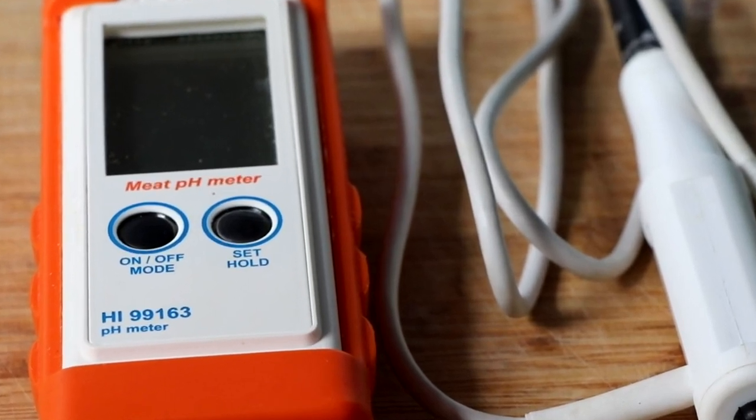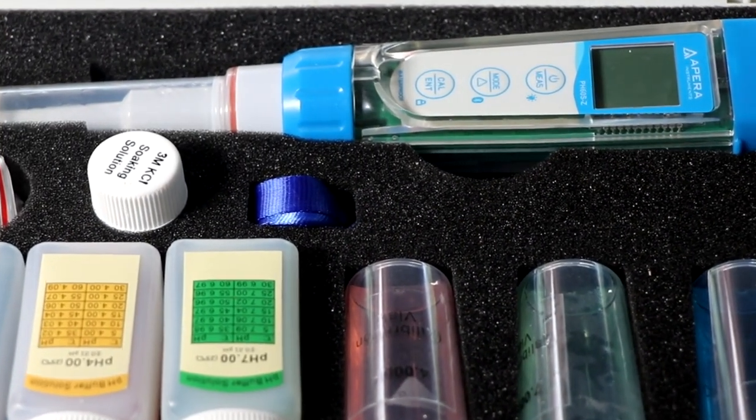We're going to be talking about two different pH meters in this video. The first is a Hanna Instruments pH meter and the second is an Apera Instruments pH meter. This isn't going to be a comparison video between the two because truth be told they're not even in the same class. The Apera Instruments pH meter is not only half the price but it has so many more features and benefits. The purpose of this video is to show you one piece of information that is arguably the most important thing you need to know about your pH meter, and that is something called the slope.